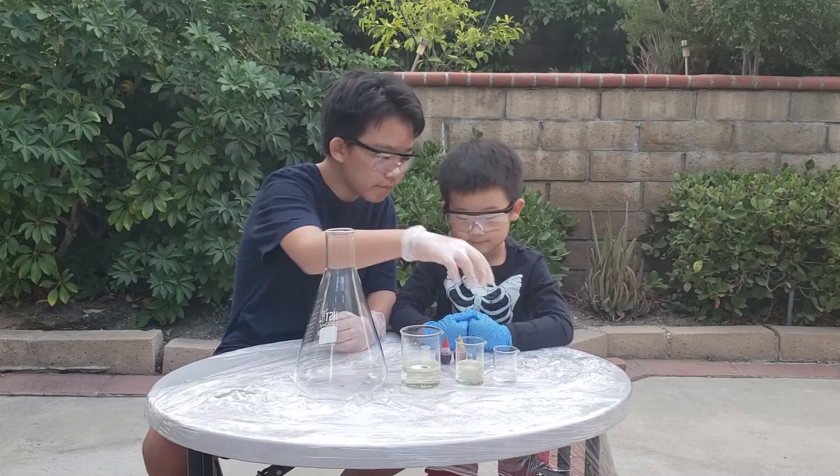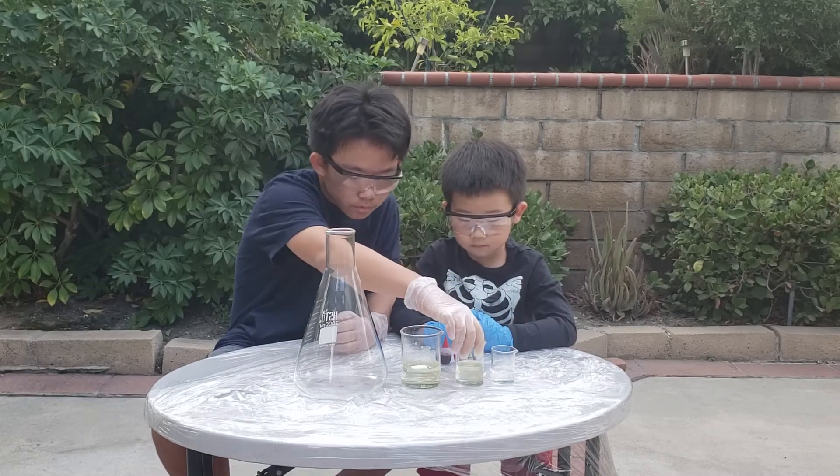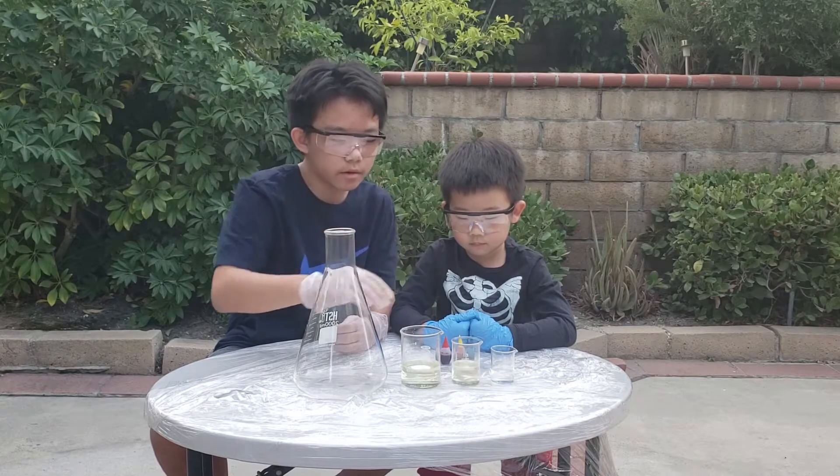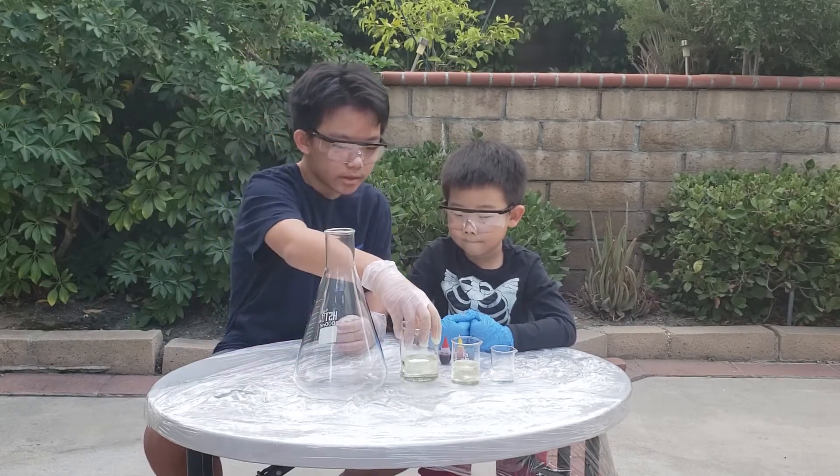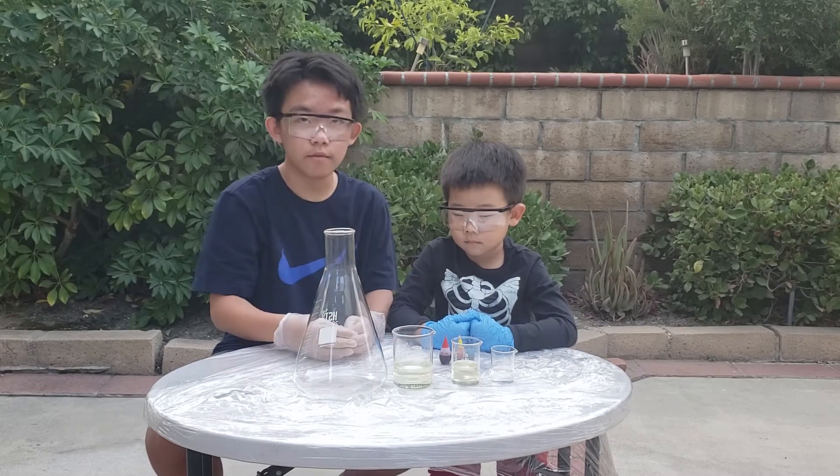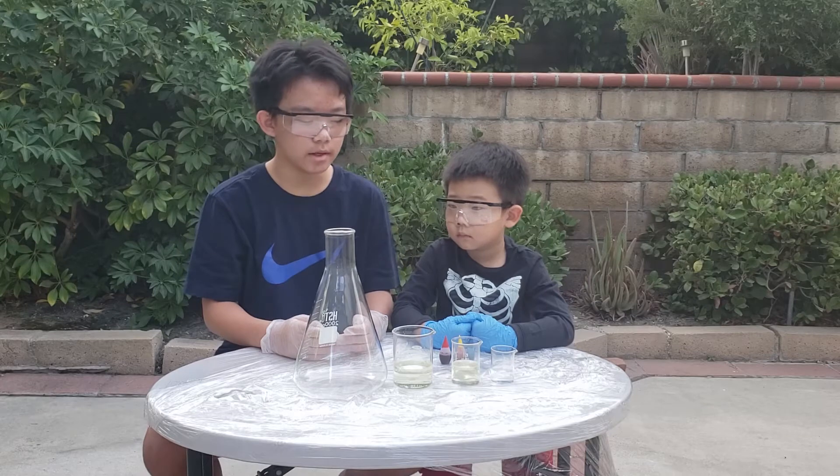One is about 20 milliliters of liquid soap. Number two is about 50 or 60 milliliters of 30% potassium iodide. And this is about 120 milliliters of concentrated hydrogen peroxide, aka 30% peroxide.